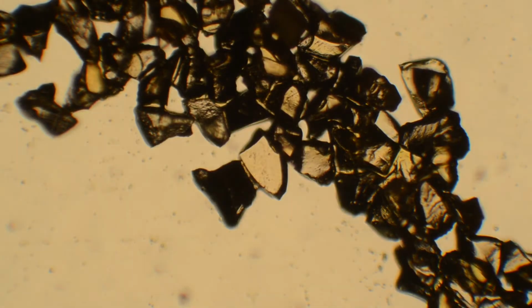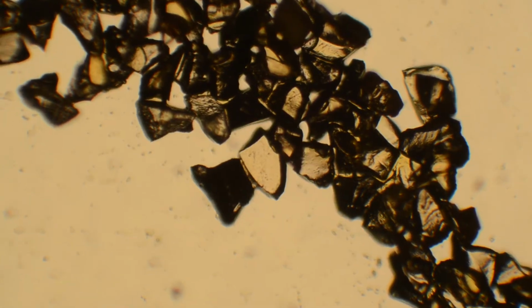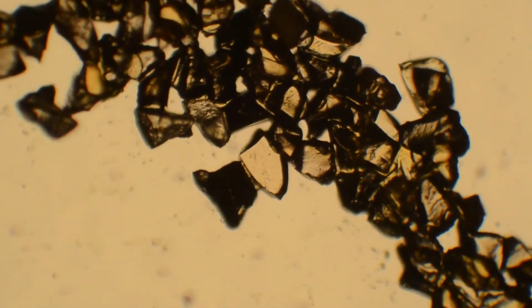Next, we will determine if a mineral has low, medium, or high relief. We do this by observing the appearance of the thickness of the grain boundary. A very faint line has low relief, while a very dark line is considered high relief. Here's an example of a mineral with high relief. Notice how the appearance of the grain boundary is significantly thick and quite pronounced.